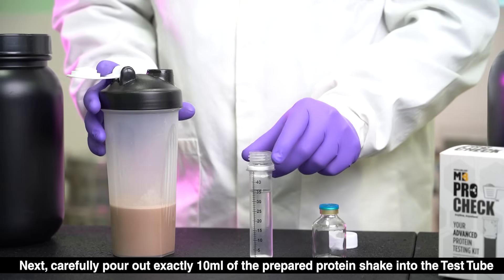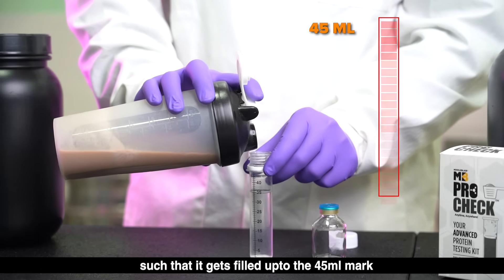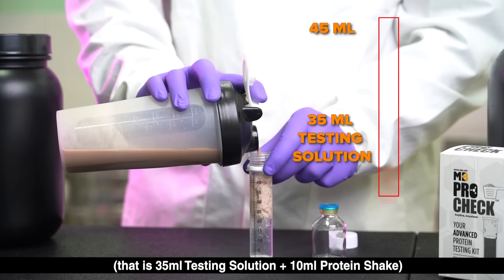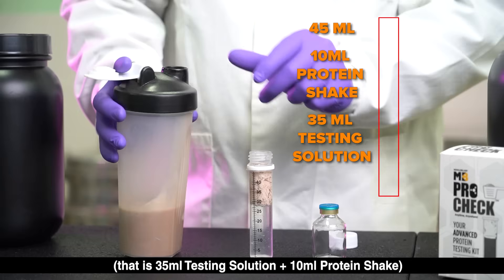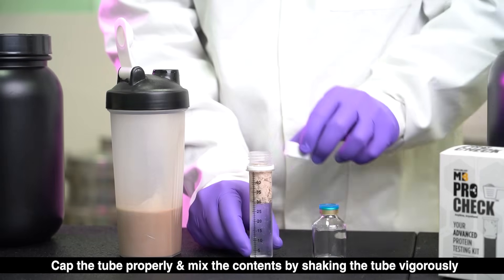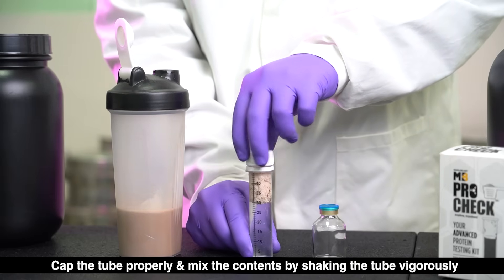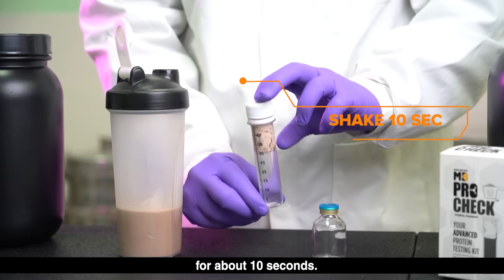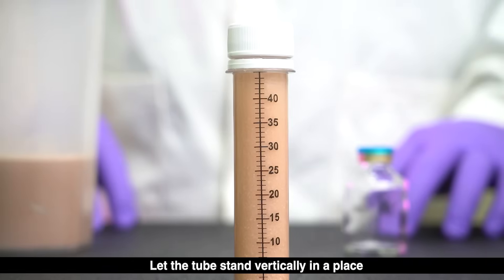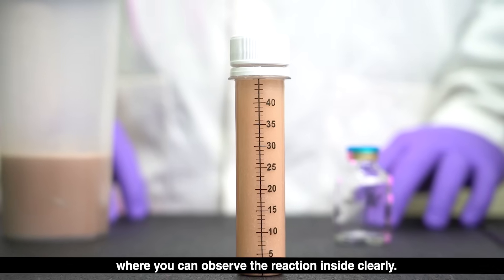Pour the shake into the test tube such that it gets filled up to the 45 ml mark — that is, 35 ml testing solution plus 10 ml protein shake. Cap the tube properly and mix the contents by shaking the tube vigorously for about 10 seconds. Let the tube stand vertically in a place where you can observe the reaction inside clearly.